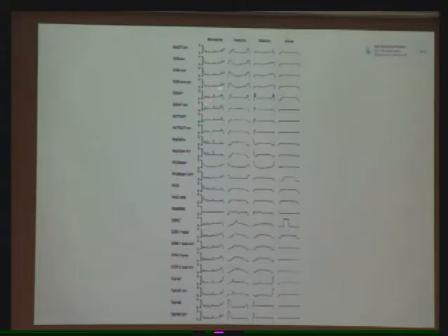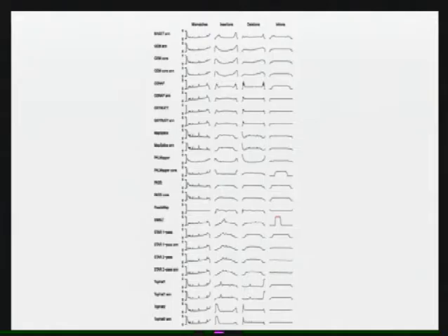So like this one is getting a lot of insertions at the ends of the reads. This is a little more consistent. Anyway, I'll just mention that really briefly. OK. So I think I said all of these things.